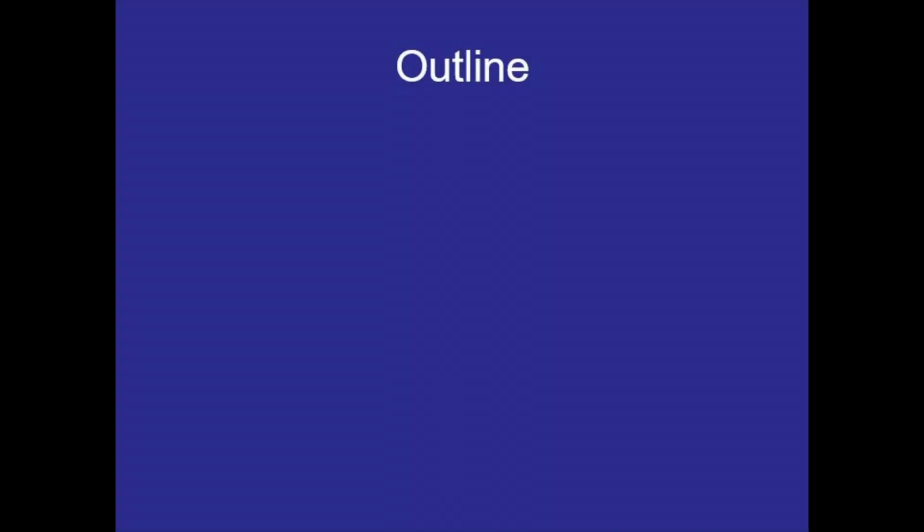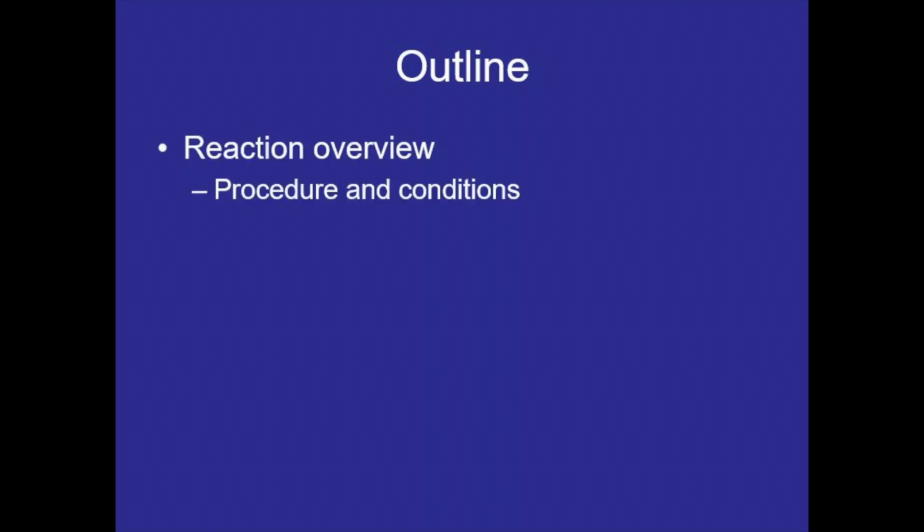Hey everybody, welcome to the Benzoin Condensation lab. Here's the outline for the video. I'll be going over the reaction and talking about the procedure and some of the conditions for this reaction. Then I'll show the experiment in the lab.